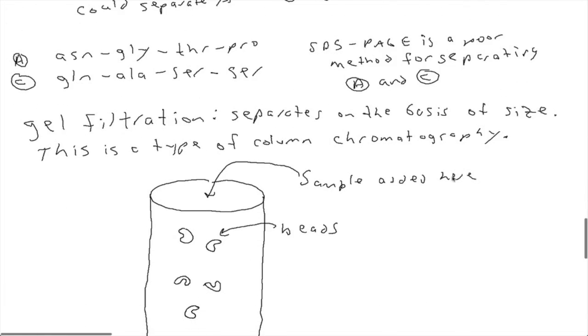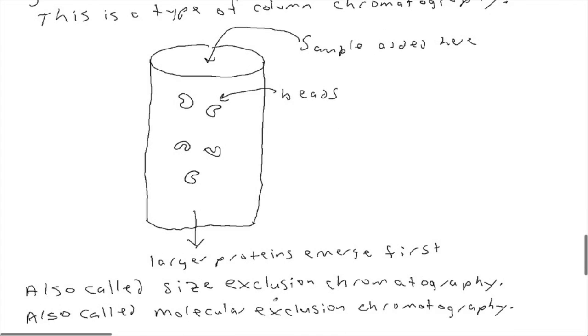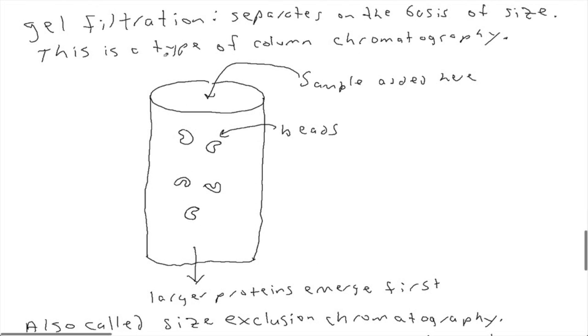Okay, what would be the drawback of only doing gel filtration? Suppose that you just take your homogenate and you do gel filtration and then you stop. Why would that probably not be very pure? Because you can have other proteins of the same size. Perfect. Good. That's what I was going for. The problem here is that you could have a mixture of your target and other proteins of the same size. If there are other proteins that are the same size as your target, those won't be removed by gel filtration.